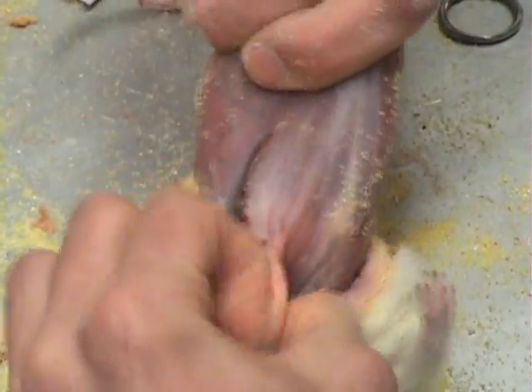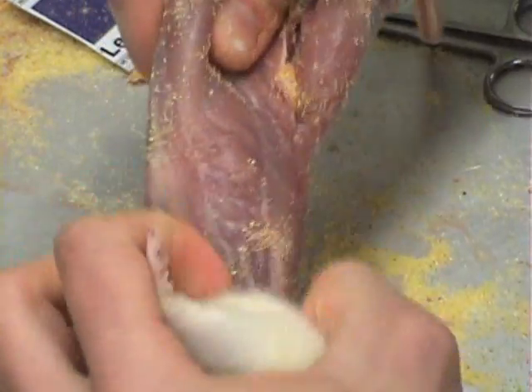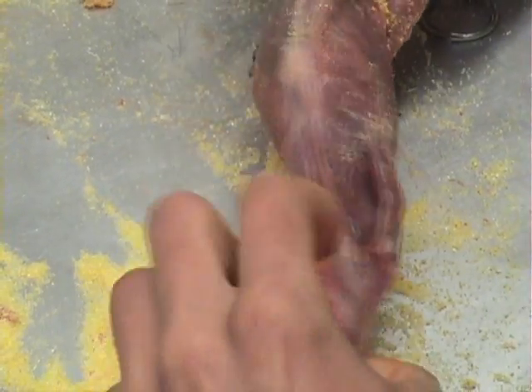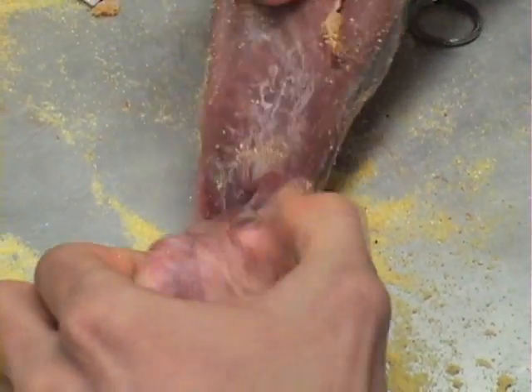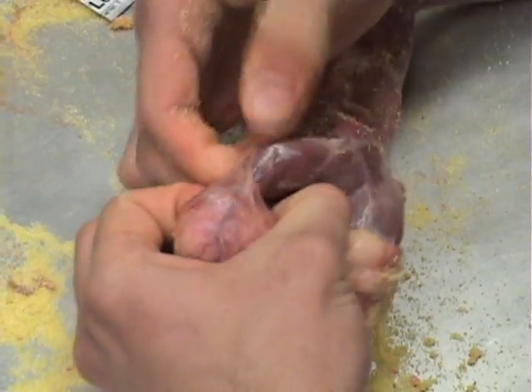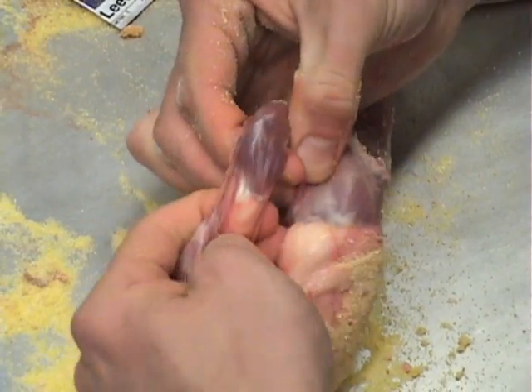Work the skin down until the front legs are reached. At this point, the legs will need to be cut at the elbow joint in the same fashion as the rear legs were done. For smaller animals, scissors will suffice, but for larger animals a wire cutter may be needed.